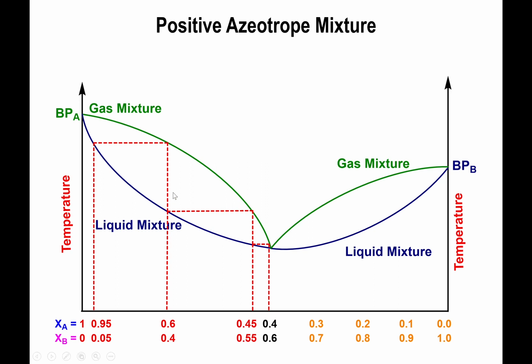But one thing to be said is that the component that is on the upper limit right here is technically what's present in your original heating flask. So in the heating flask, if you heat it up long enough, you could actually remove all of B from the original flask and collect pure A in the actual heating flask that you started with. But in the collection flasks, the most you're gonna get is 60% B, right? You will not be able to get pure B from this particular setup. So 40% A, 60% B.